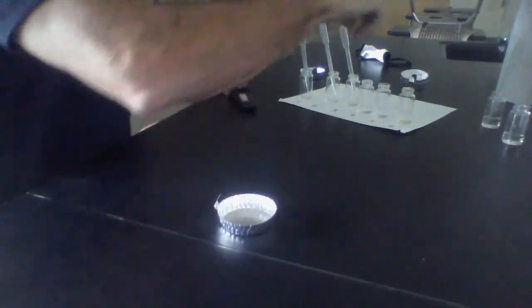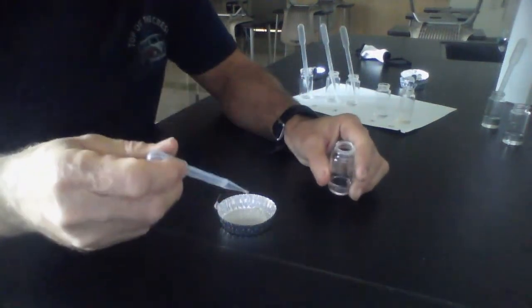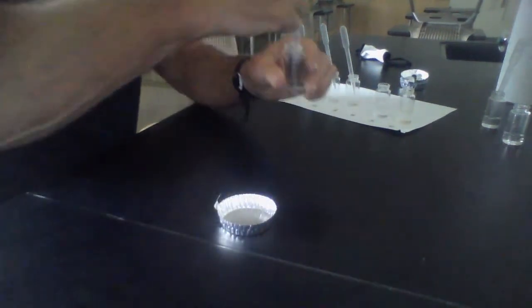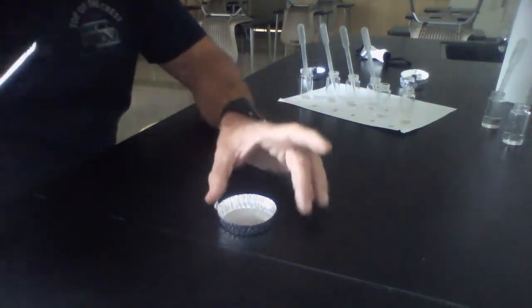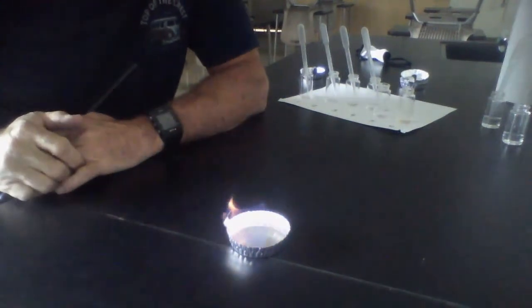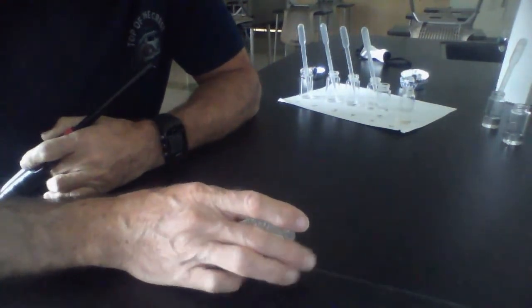Number 4. Five drops. Staying safe. 3, 2, 1, ignite. Gone. It formed a candle, and then it moved way over to the side really quick. It seemed more volatile to me, just the way it acted.